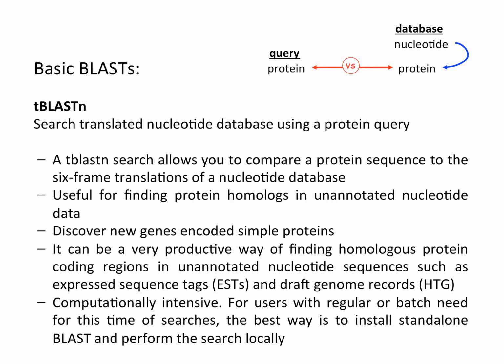They comprise the largest pool of sequence data for many organisms and contain portions of transcripts for many uncharacterized genes. Since the ESTs have no annotated coding sequences, there are no corresponding protein translations in the BLAST protein database. Hence, a T-BLAST-N search is the only way to search for these potential coding regions at the protein level.